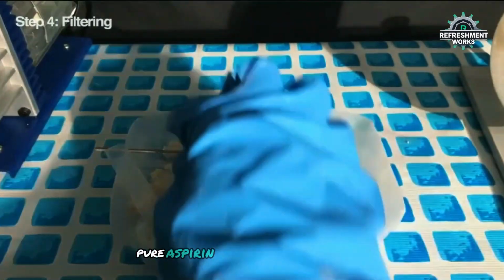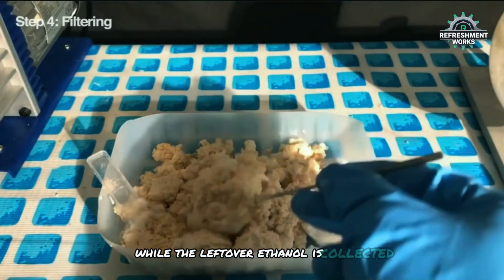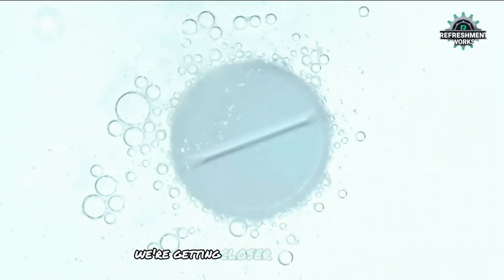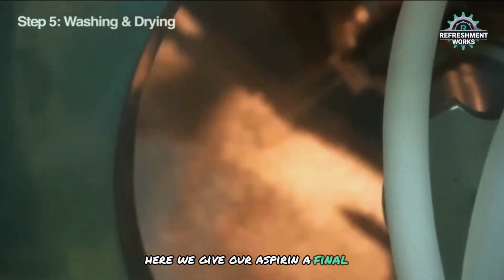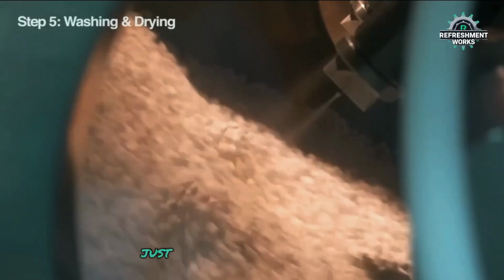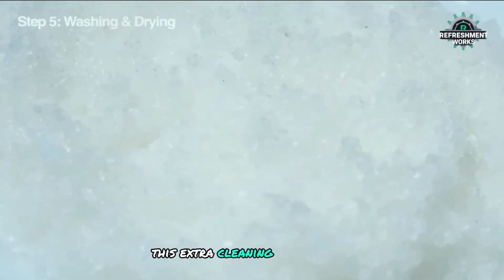Just like that, pure aspirin crystals are left behind on the filter, while the leftover ethanol is collected separately. We're getting closer and closer to that final, perfect aspirin. We filtered out the big chunks of leftover ethanol, but there might still be some tiny impurities clinging to the aspirin crystals. Here we give our aspirin a final rinse with a solvent or water, just to be absolutely sure everything unwanted is gone. This extra cleaning step makes the aspirin crystals even purer.